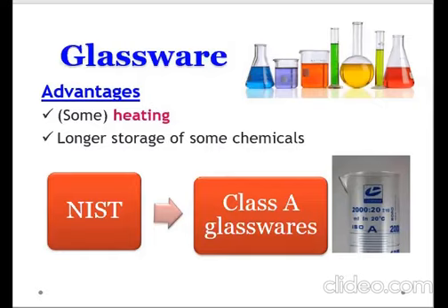But I hope you noticed in your lower year levels, especially in your lower chemistry subjects, that not all glasswares are used in heating. For example, your graduated cylinder, when did you ever put a chemical in it and heat it? Or a graduated cylinder with a Bunsen burner.